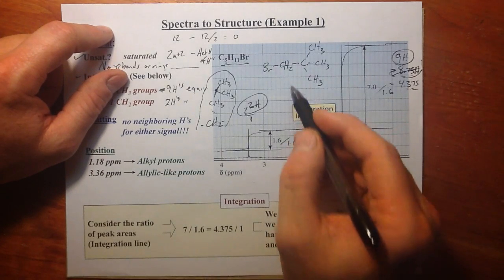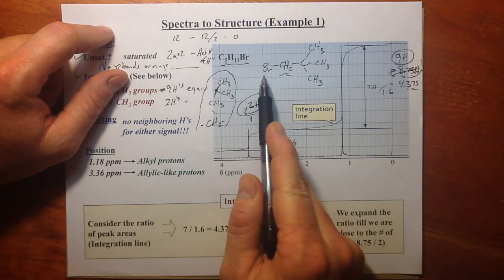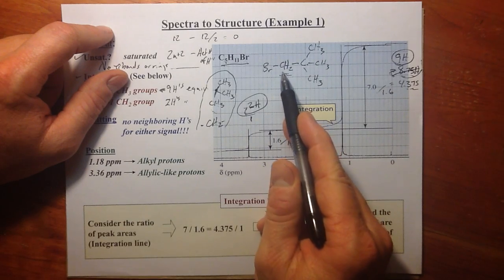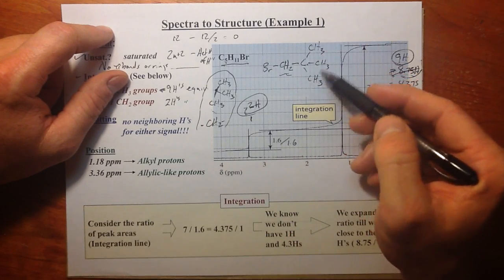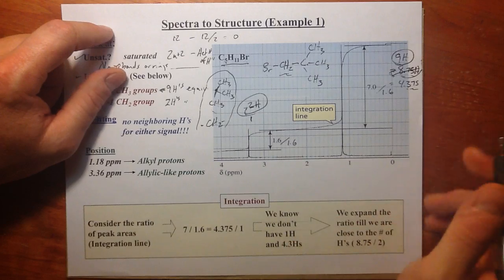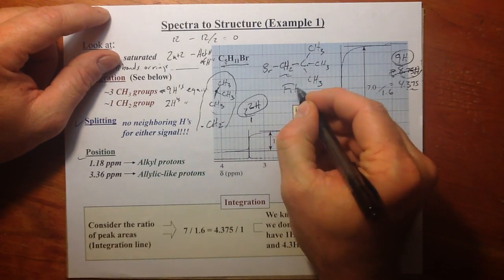And now let's look at position. This is downfield. This one's downfield. Why would that, I guess, still fit the spectra? Well, because the bromine would pull, and it'd be in that, I guess, 2.5 to 4.5 range that we'd expect these 2 protons to fall because they're next to a heteroatom. We'd expect these to be alkyl, somewhere between 0.5 and 1.5, and sure enough, they are. Maybe just a little bit above 1 because of this halogen and its withdrawing effect. So that's kind of the game you play. Our position matched up, our splitting matched up. This structure just fits.